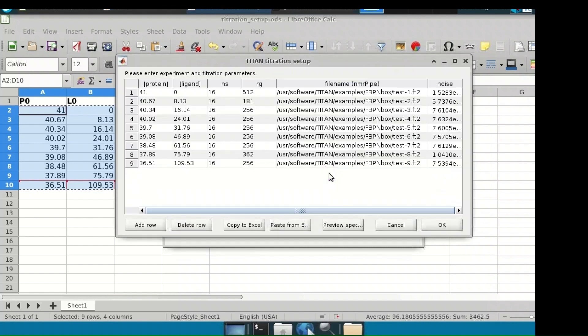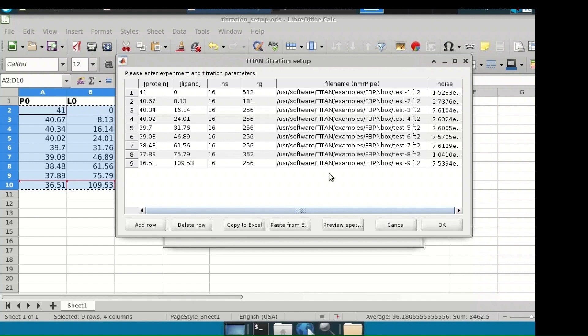Once selecting a data file named either manually or by pasting from the clipboard, Titan will automatically calculate an estimate of noise in the spectrum. This can be manually overwritten if necessary. Accurate noise levels are necessary for correct weighting of residuals across multiple spectra. Plot the data to check if it has been correctly imported by viewing it as a colour map using the preview spectra command.